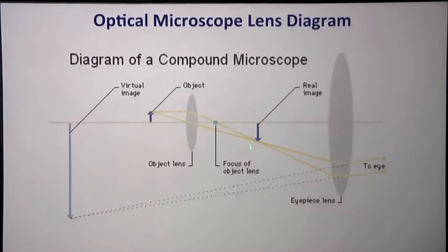And the image, we call it the real image if it's in the opposite focal plane. And if we reproject this onto some detector, we see a virtual image that can be magnified. Right? So this is the virtual image, this is the real image, this is the object, this is the lens. And this would be what we would call a projector lens in an electron microscope.